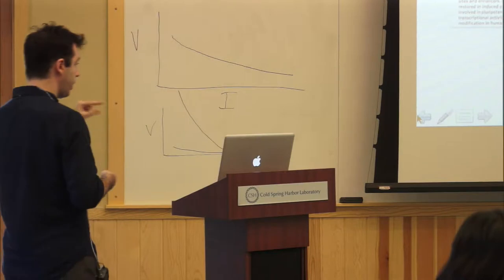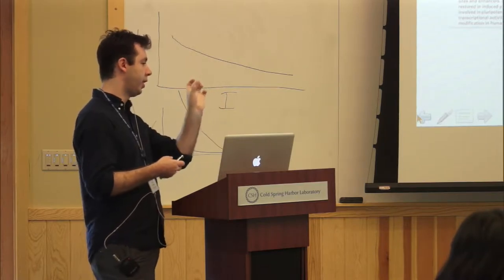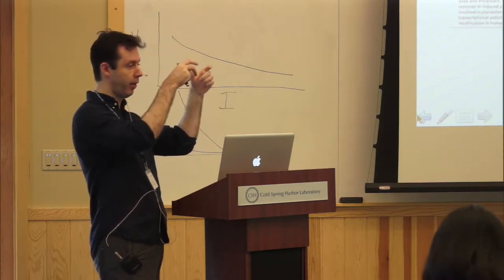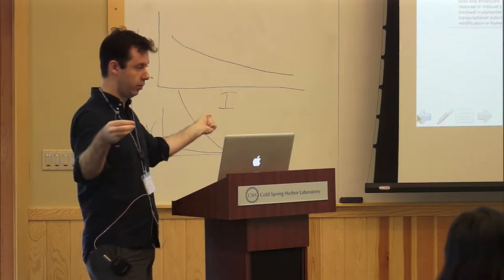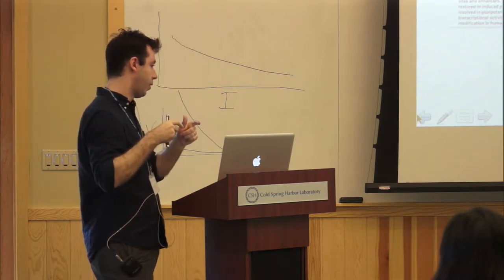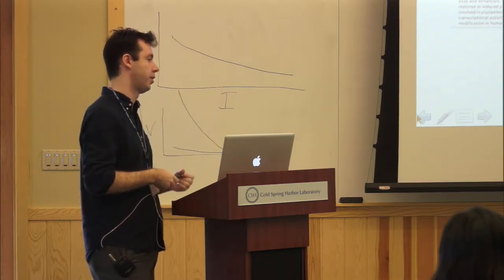Now, what I also want to say is that in bisulfite sequencing, you also in silico convert the reads. Because it's just mapping at the end of the day, you're only interested in mapping your reads back to the genome, right? So you're right that you have a read, it's going to have some methylation events, and some cytosines are not going to be methylated, so you're going to have a mix. What you do is, in addition to converting the entire genome to a bisulfite reference genome, you also convert the read itself, so that you can actually map it with better accuracy. But you store the original version of the read so that you can revert back to it when you do a calculation of the fraction of methylation.